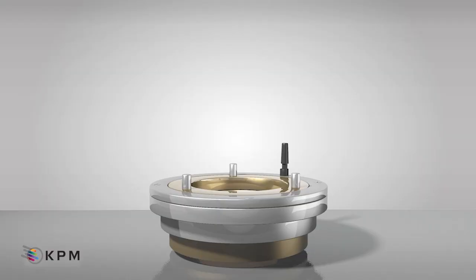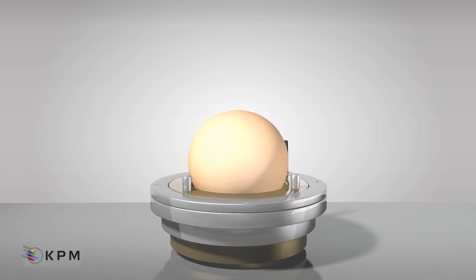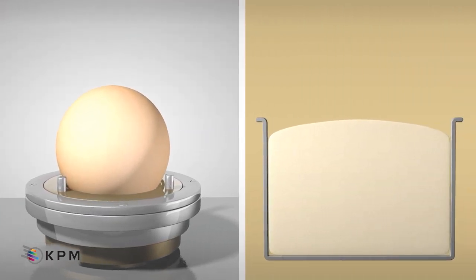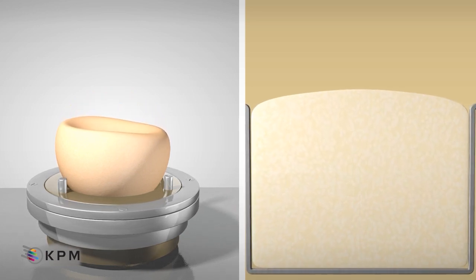An Alveograph test involves measuring the deformation of a dough bubble caused by a specific pressure generated using air. This dough extension simulates the deformation a dough undergoes during fermentation due to the pressure generated by carbon dioxide.